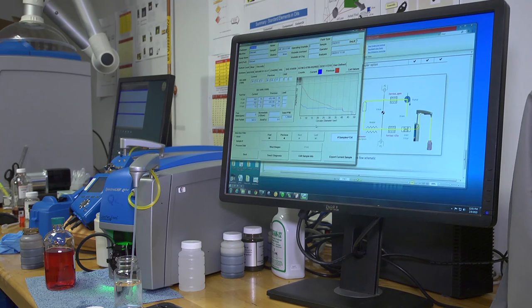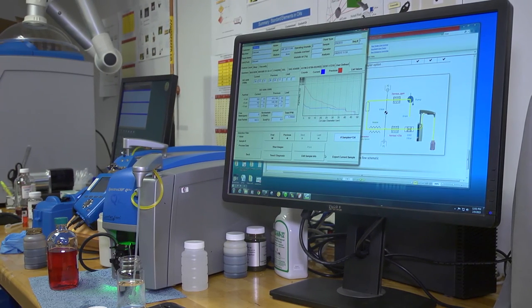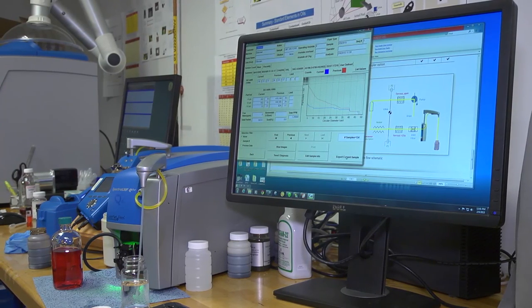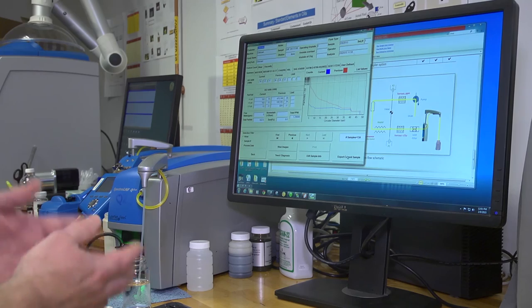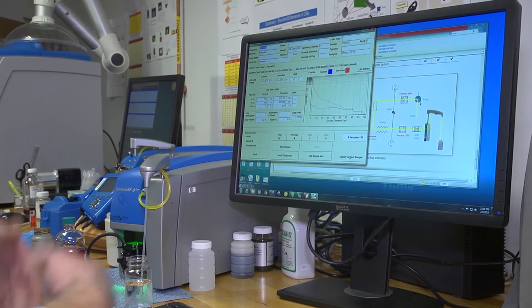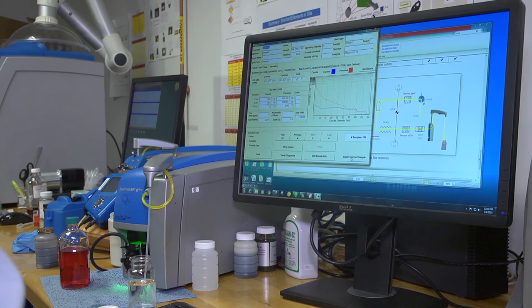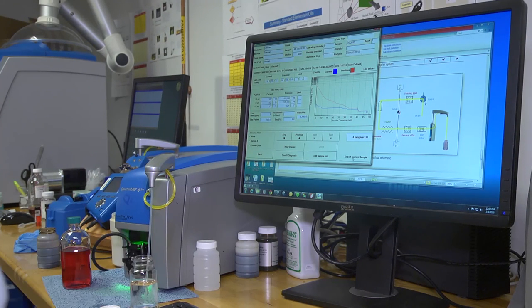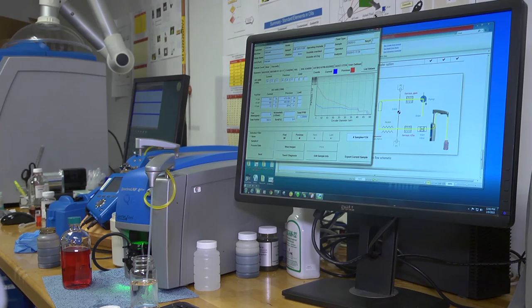Now, if more than a simple report is interested, you can actually export into a CSV file. So if I wanted to export the results of this file, I can either export a single file or multiple samples. It makes no matter, you get to select that. Select export. That batches it off into a file, which we'll pull up here.